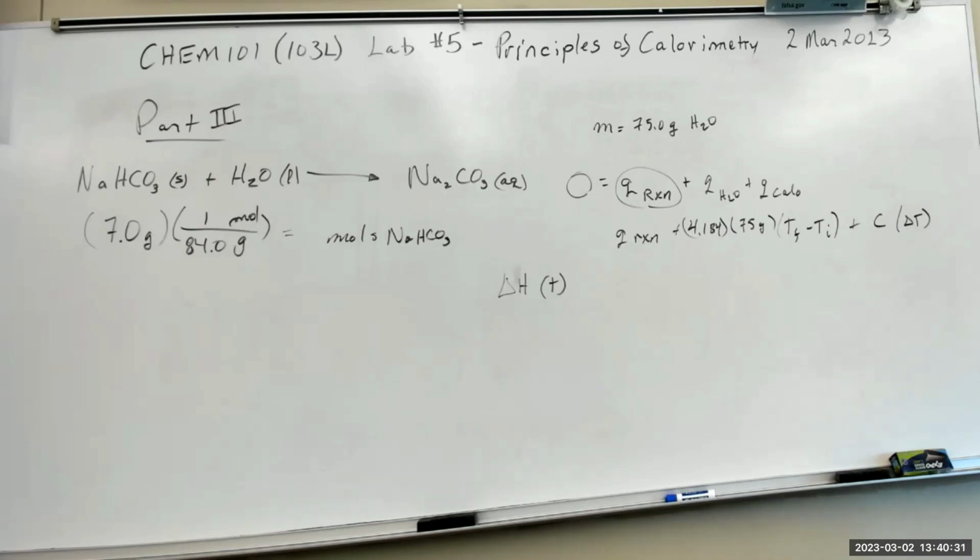The end product here is, if the water in your cold pack or hot pack, and I believe they're both 500 milliliters or 500 grams each, then what you need to do is calculate how much mass of each one of those compounds needs to be in that pack to give you that temperature change.